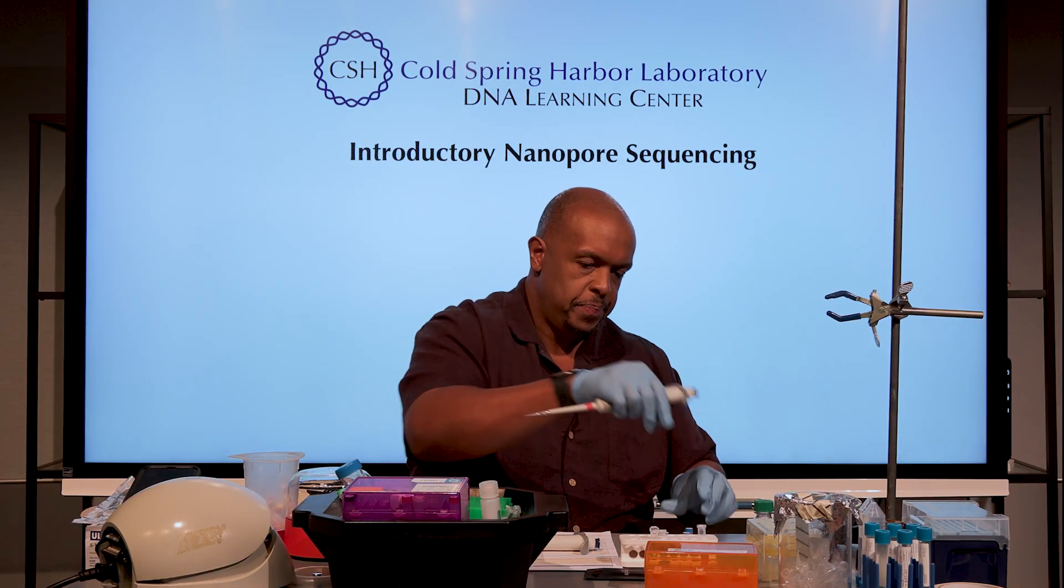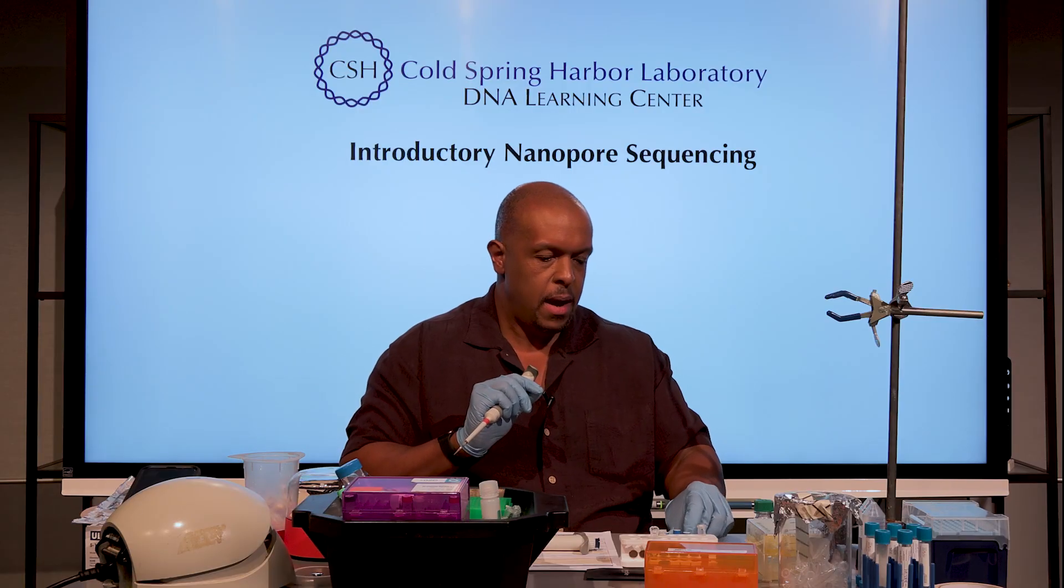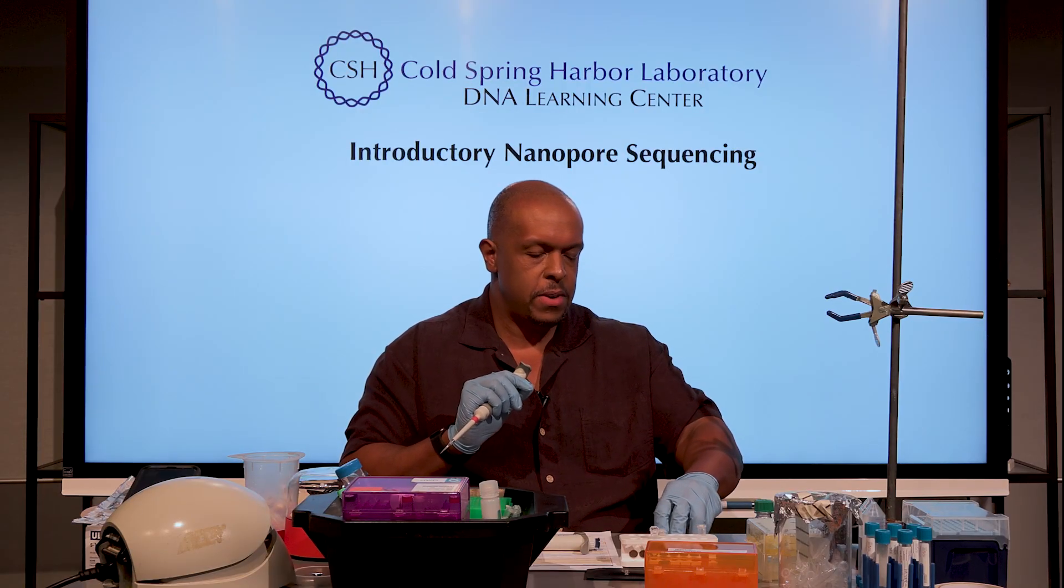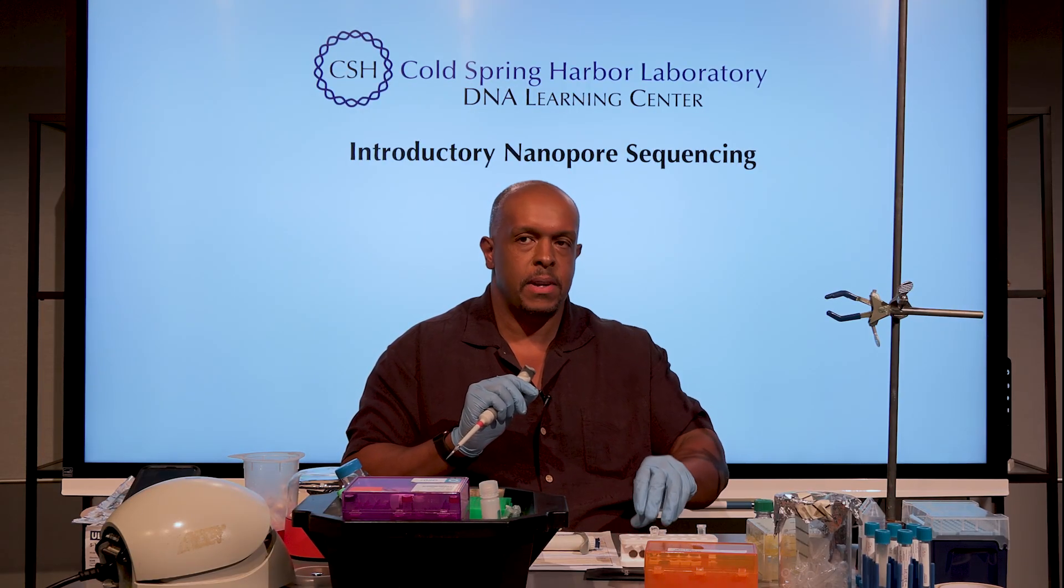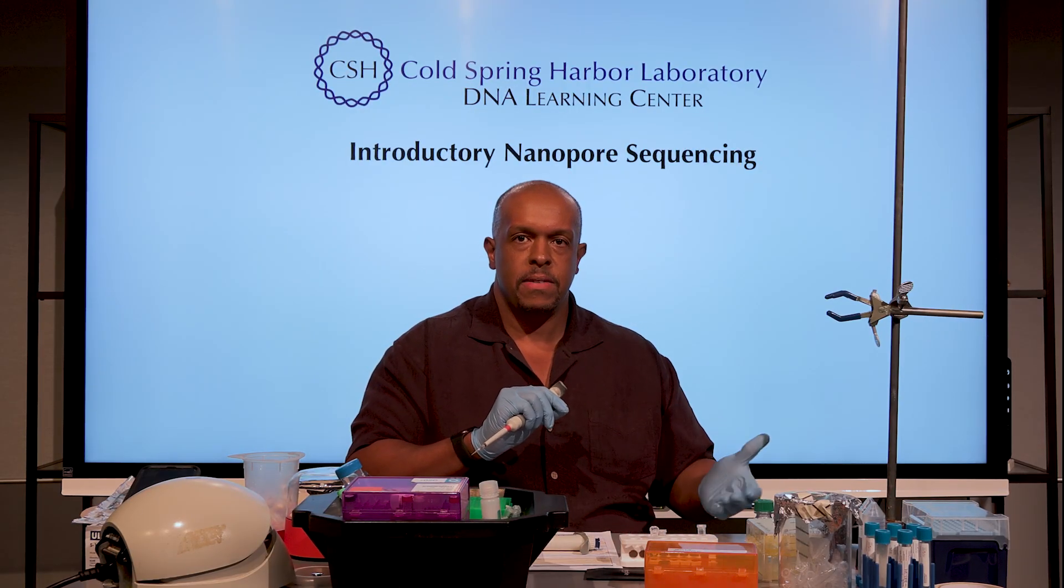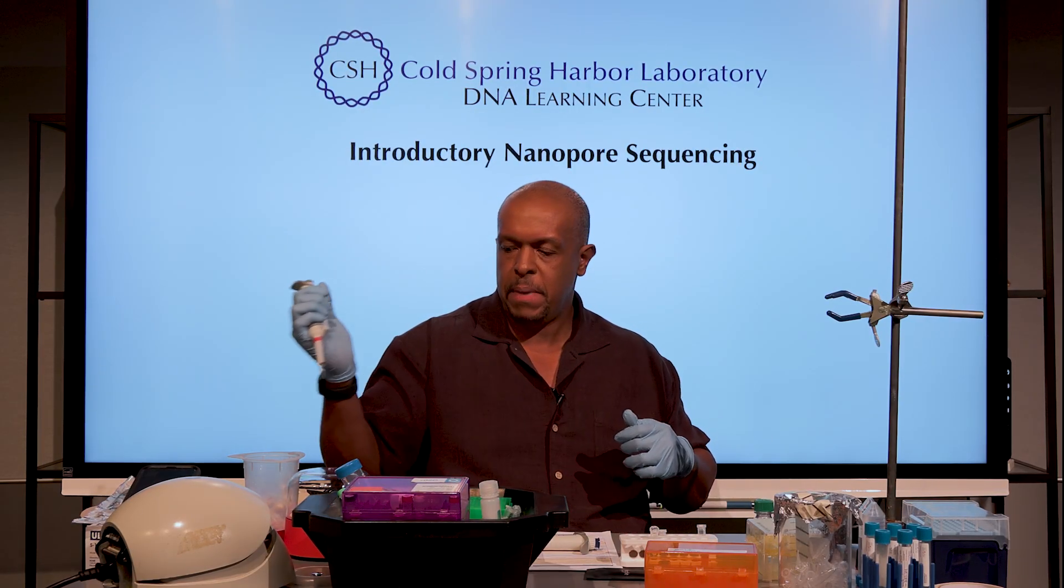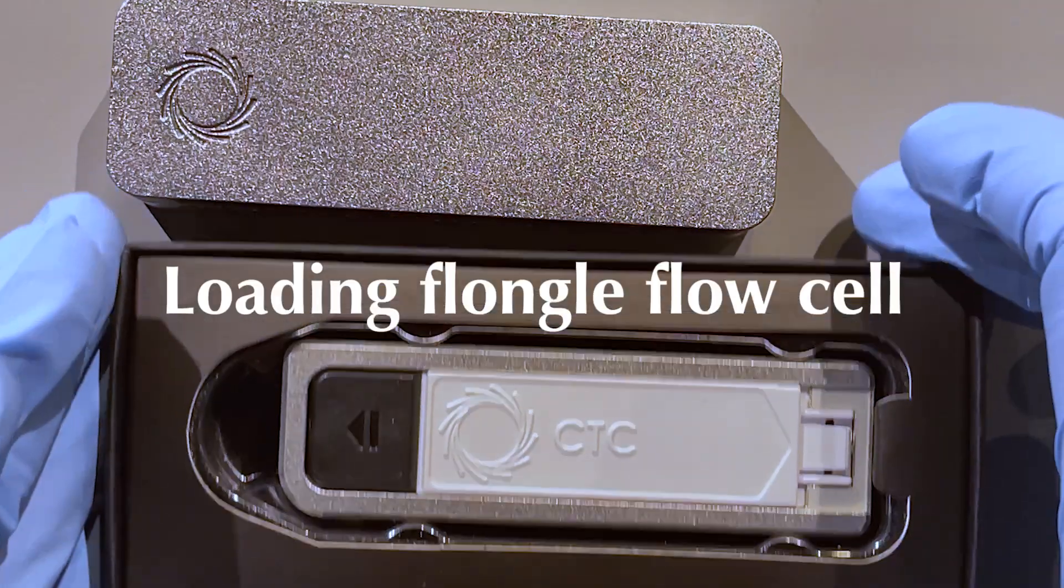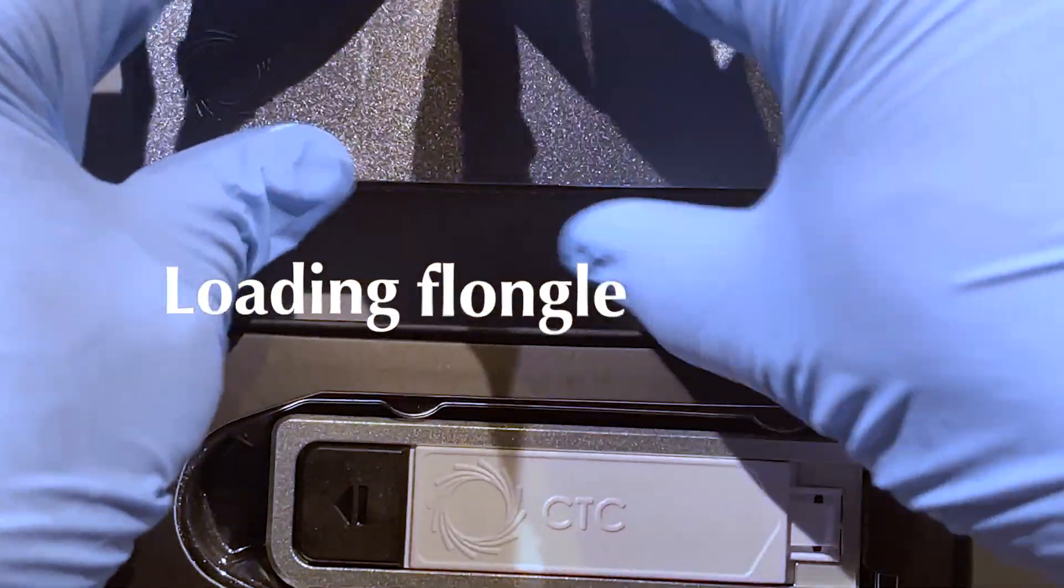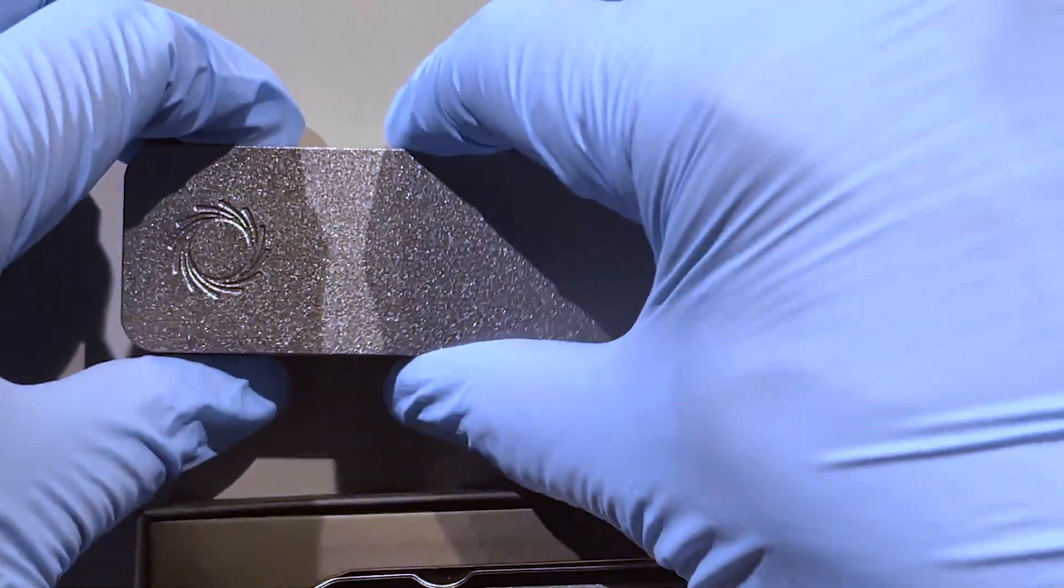Just a nice mix by tapping, and that is ready to load on the cell. I'm going to put it aside as I then go in and change my setup a little bit to emphasize and let you see a little bit better what that looks like.